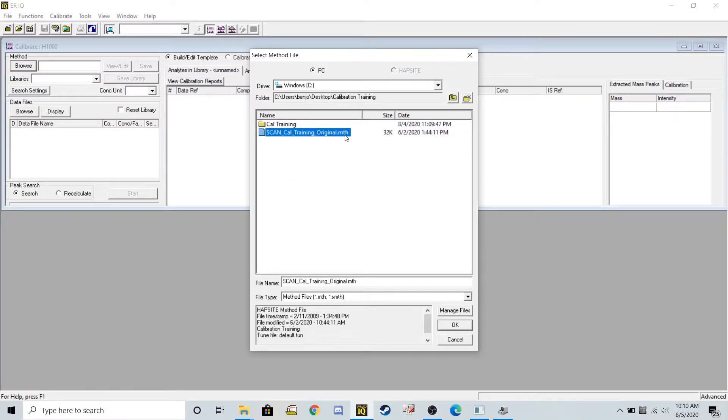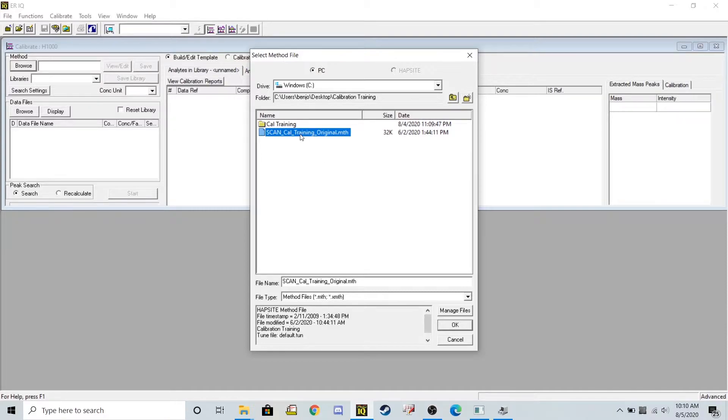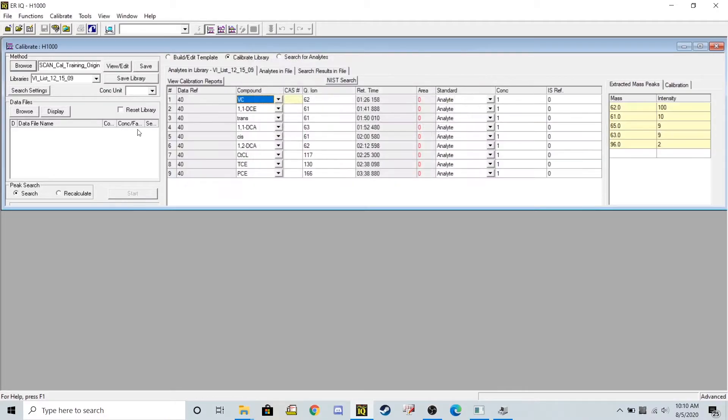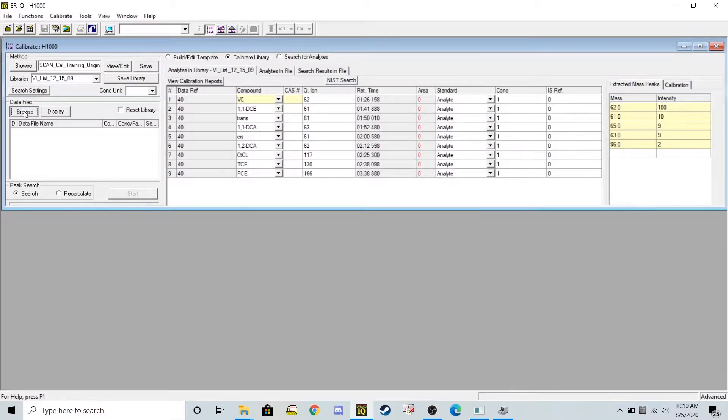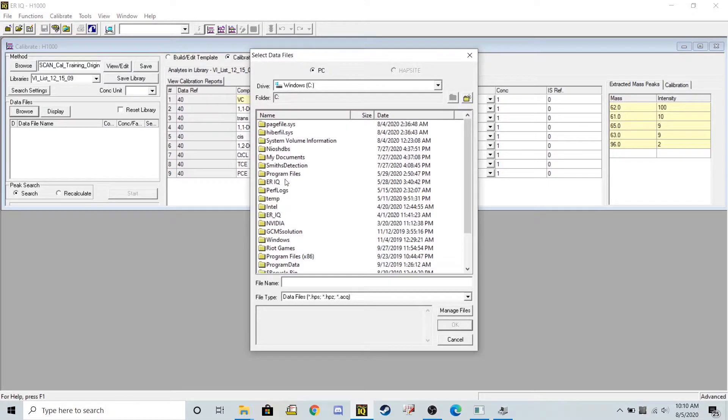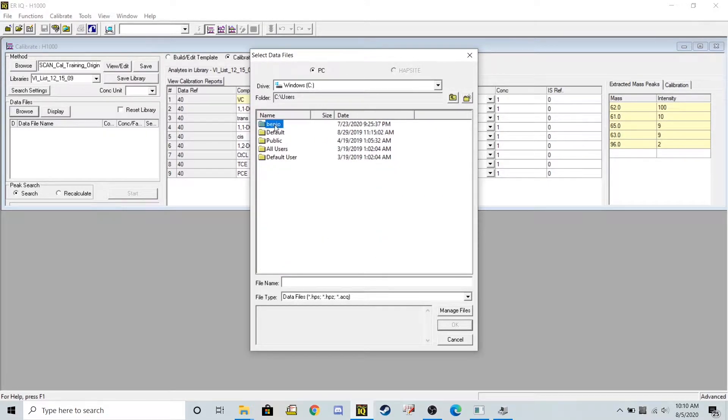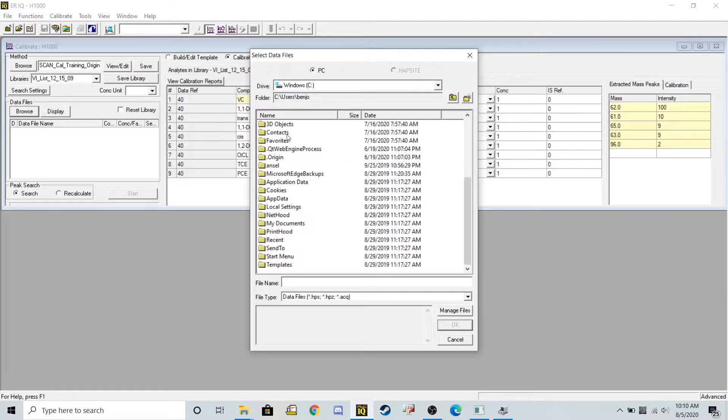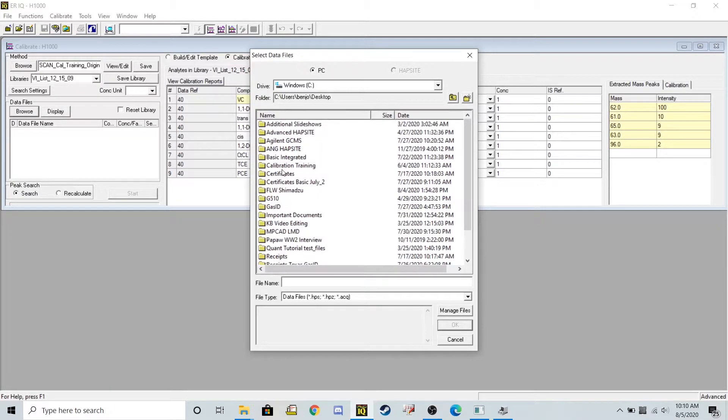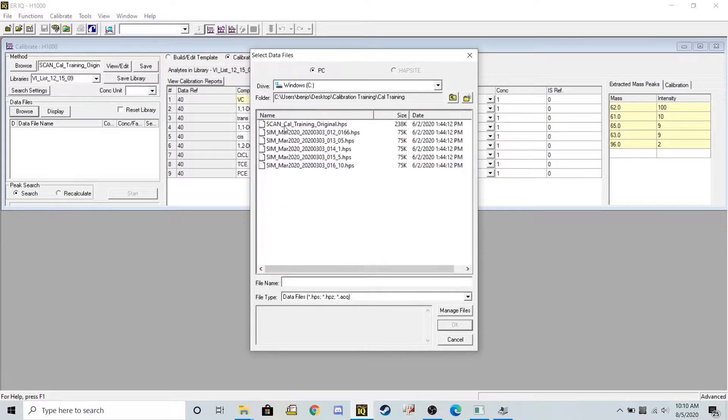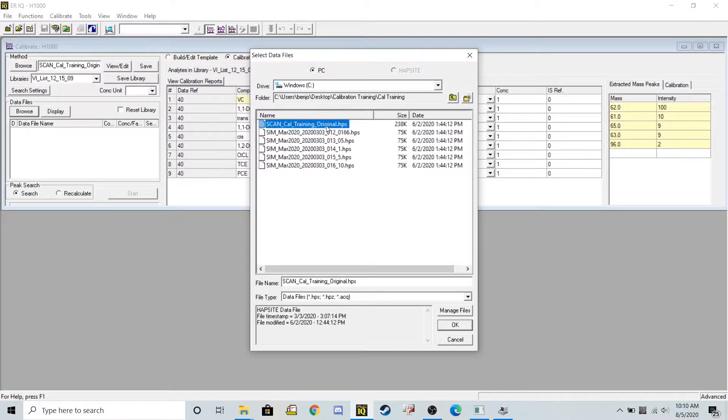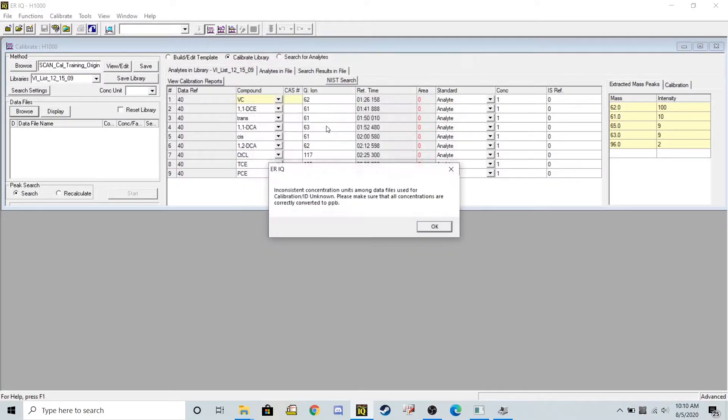So right here this mth file is my generic method and I'm also going to browse for a data file that was run under that method also on the desktop. I'm going to click my original method right here.